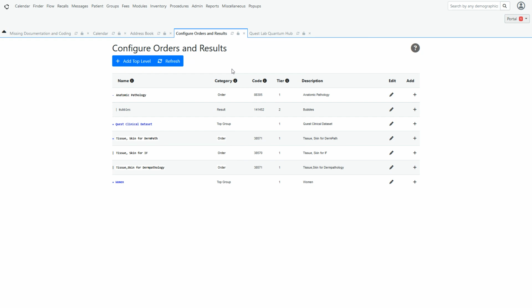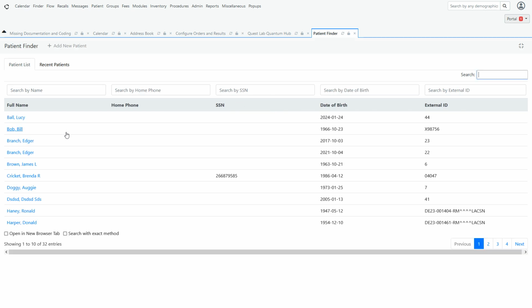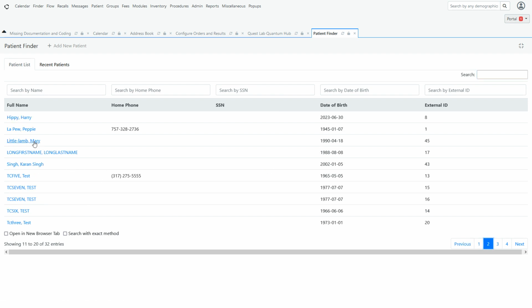So now once you've got those two things in place, you're ready to create an order in the system. So I'm going to go here, and we're going to pick up, let's do, I'm going to do Pepe Le Pew.